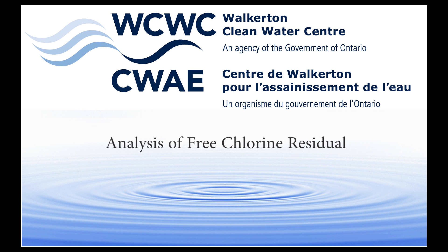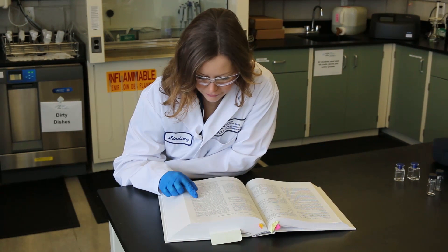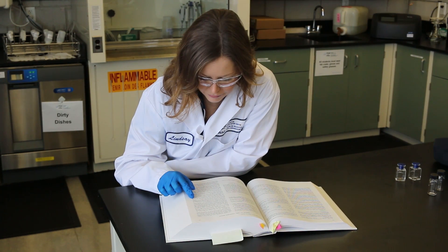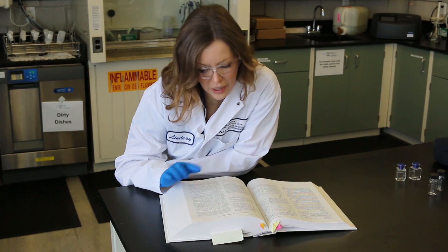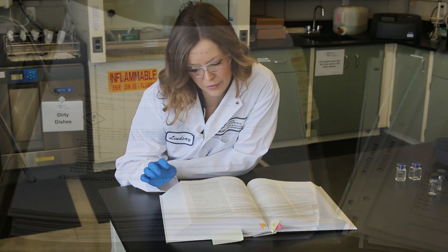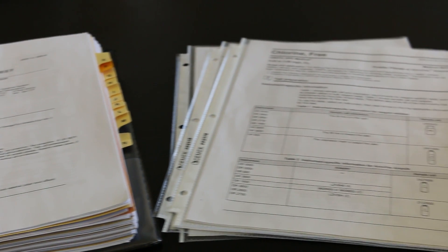This video will demonstrate how to properly analyze the free chlorine residual of a drinking water sample using the DPD method. This is a basic procedure overview and should not replace or overrule the instructions provided by your equipment manufacturer. You should always analyze samples according to the methods provided by the manufacturer.